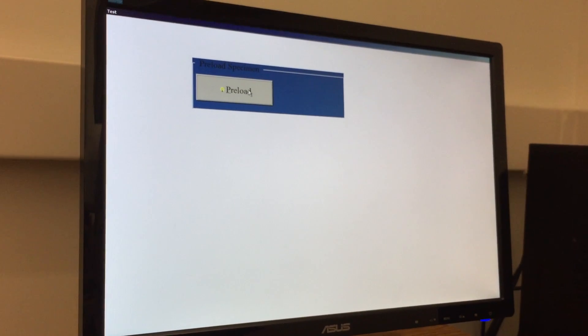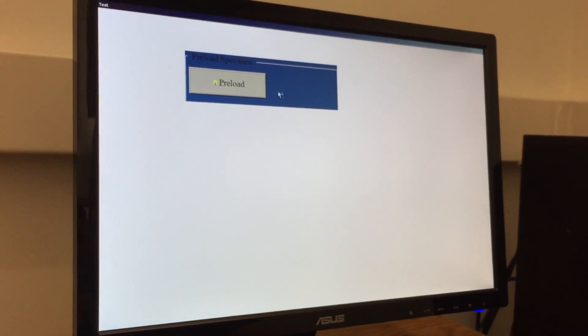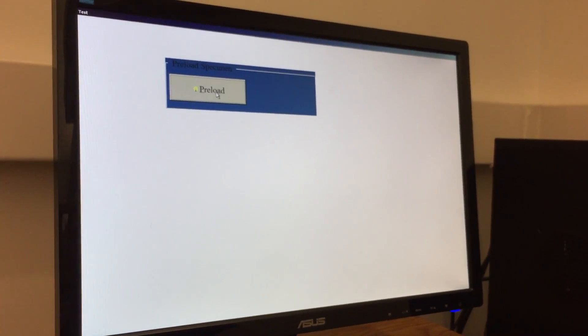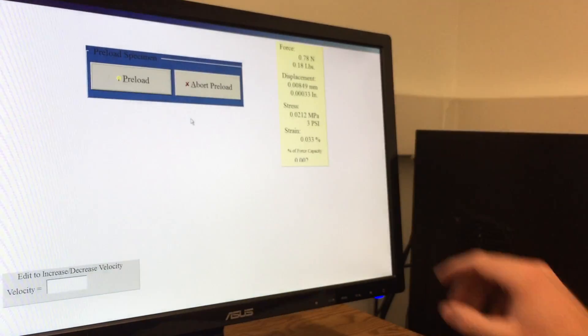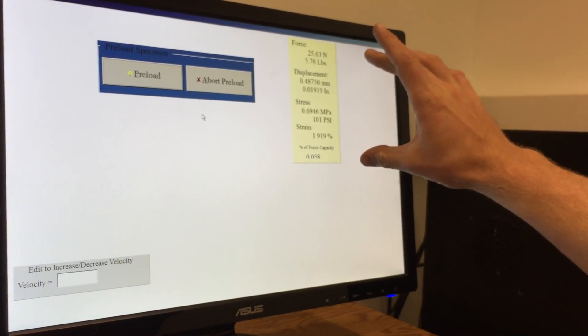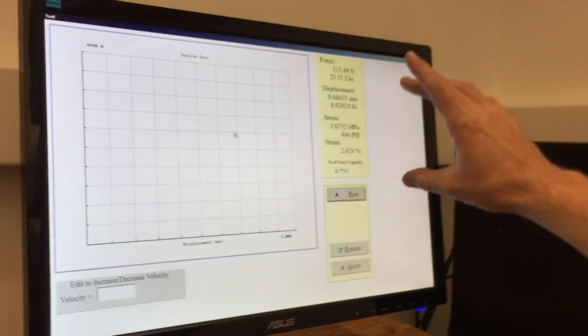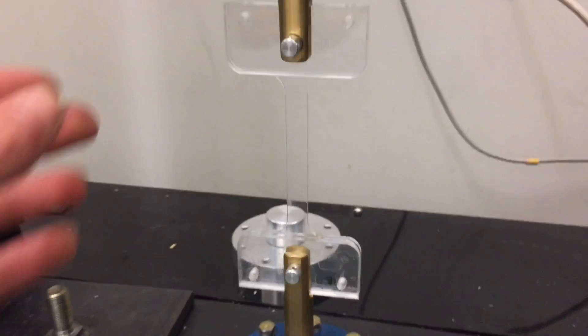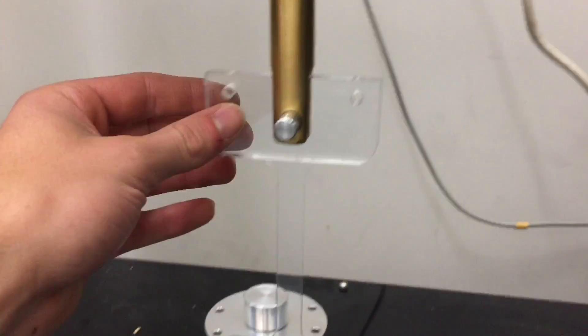Now to the pre-loading. As Sean mentioned, it's as simple as hitting preload. You'll see the numbers on the screen here change as it slowly applies the load. Once that graph appears, you can go to the test specimen and you can now see that it's in tension.